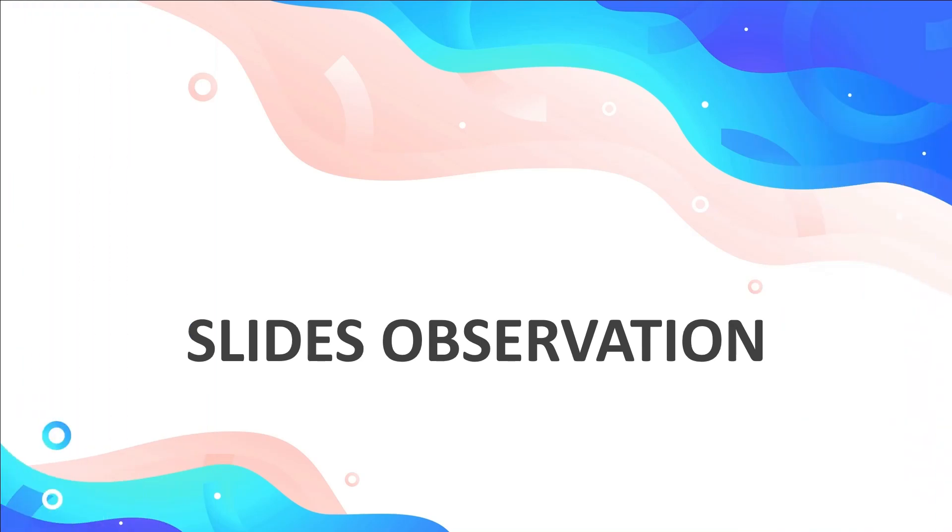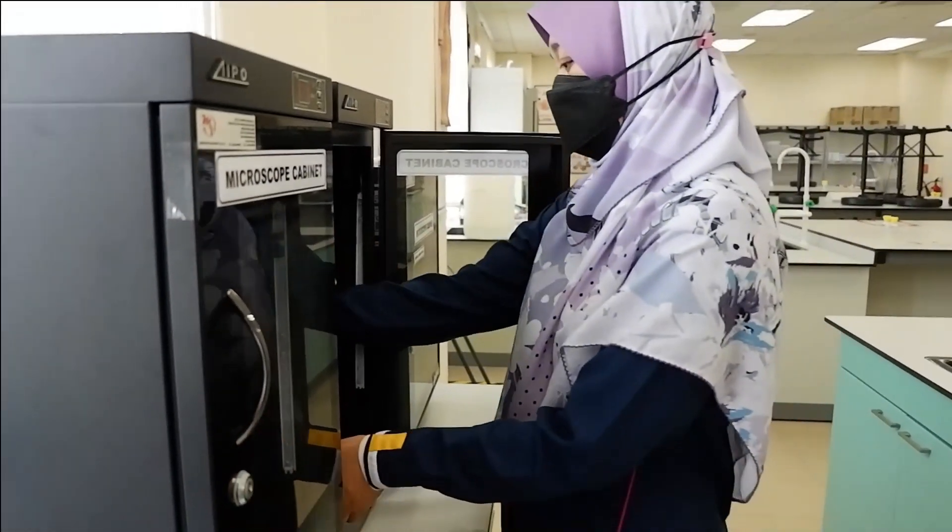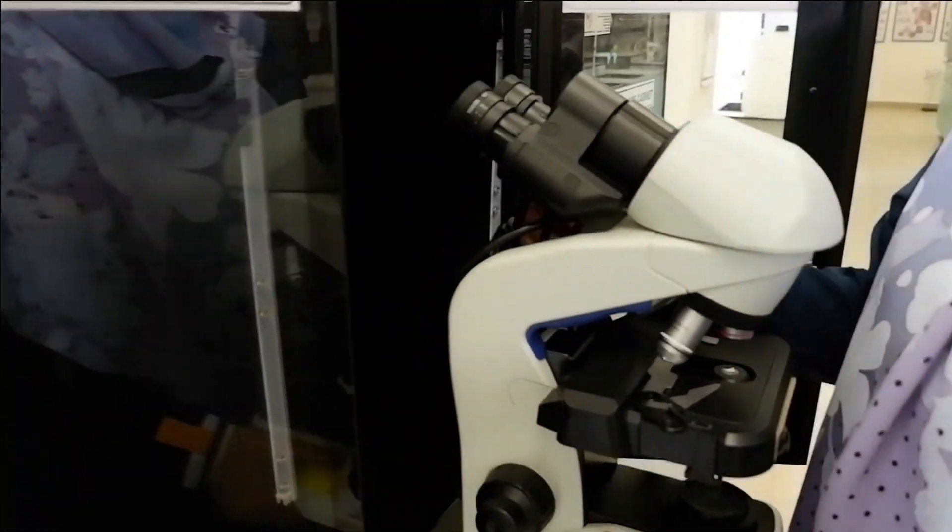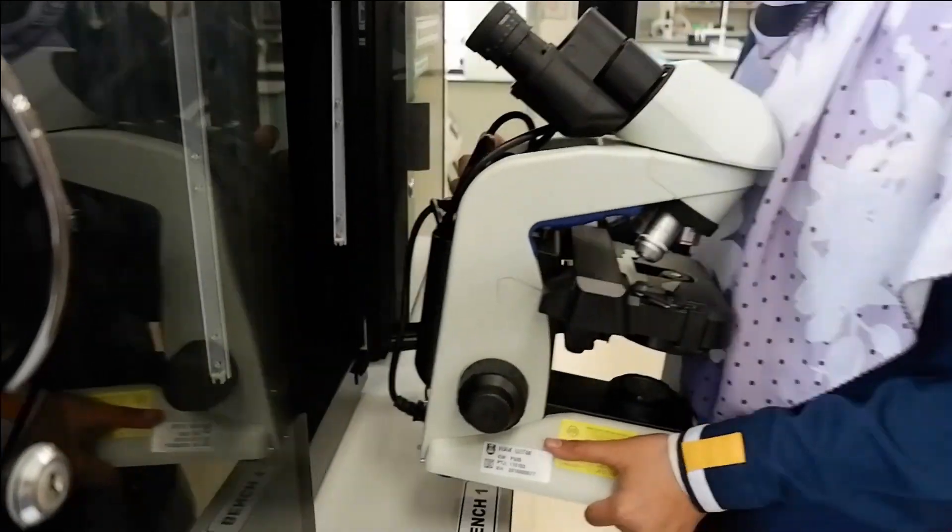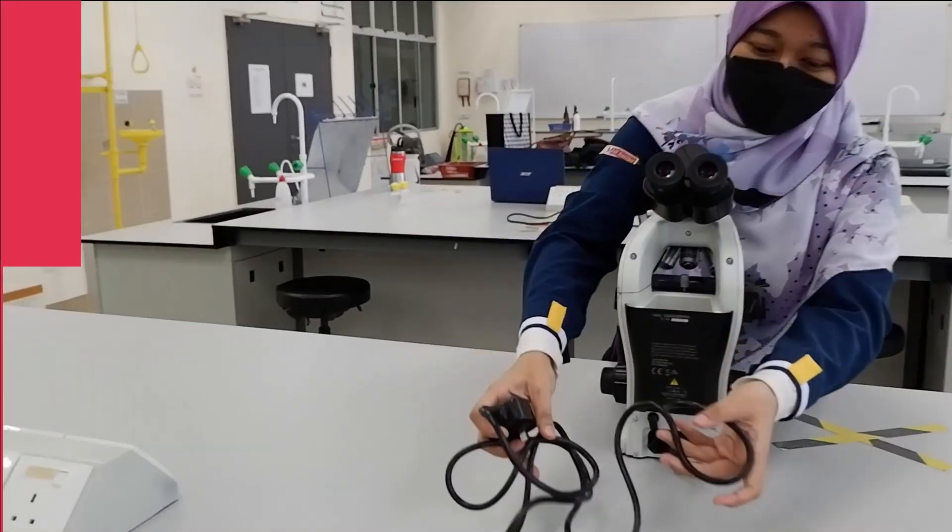Now let's continue with slide observation. You will learn the right way to use a microscope. So make sure to set 100 percent attention to the demonstration. We will use the plant cell as example. Microscopes usually are stored in a dry cabinet. If you need to get the microscope, be sure to hold it right.